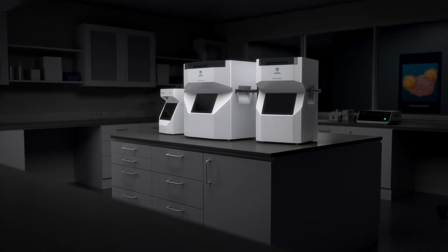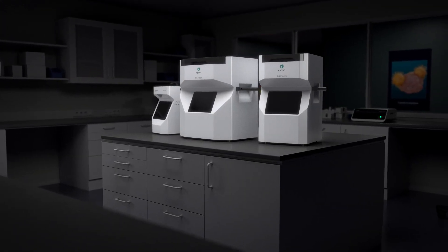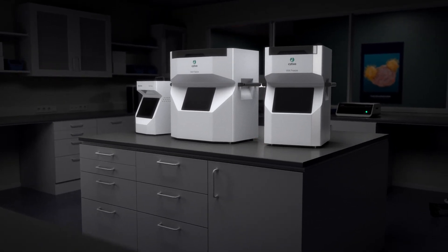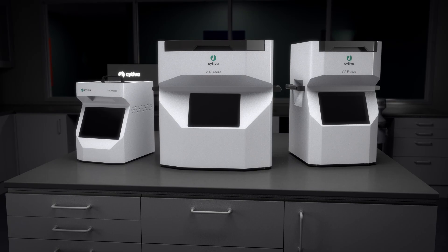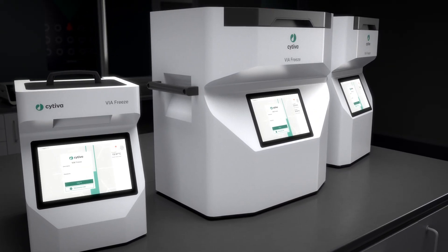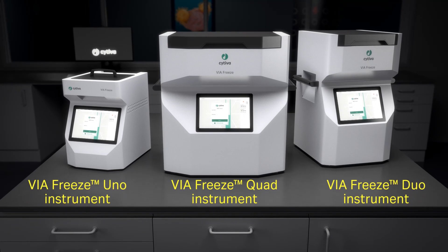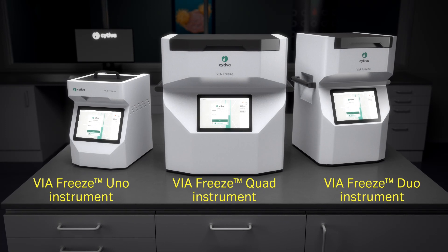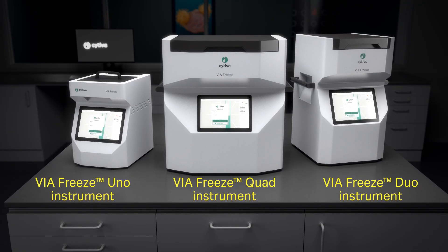Our ViaFreeze systems are liquid nitrogen free controlled rate freezers that you can use to cryopreserve cellular products in a controlled, flexible, and scalable way. Available in three capacities depending on your production volume, each freezer performs identically, enabling you to scale your process as needed.